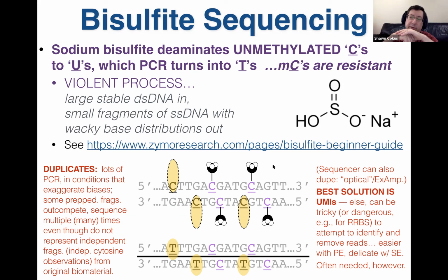With single end, you don't have that insert length variation to help disambiguate the cases, and now you're down to just picking reads that pile up at the same place. Depending on your coverage and a whole bunch of other things, whether it's a good idea to filter out things that look like duplicates that way varies.